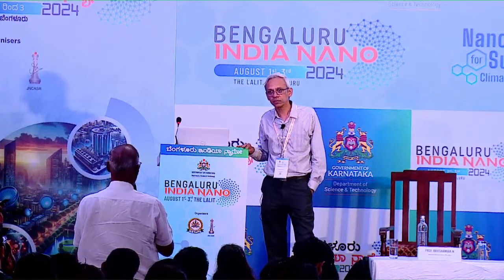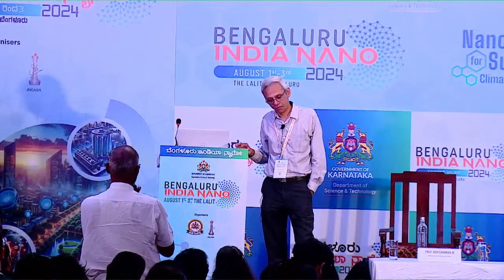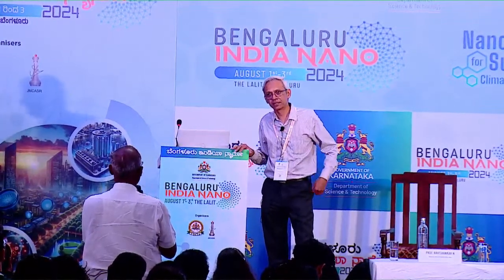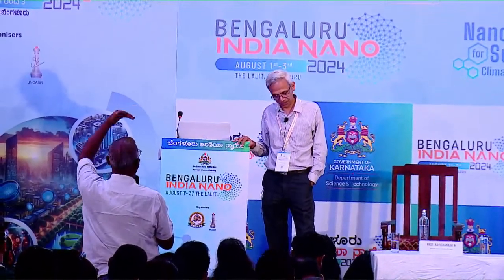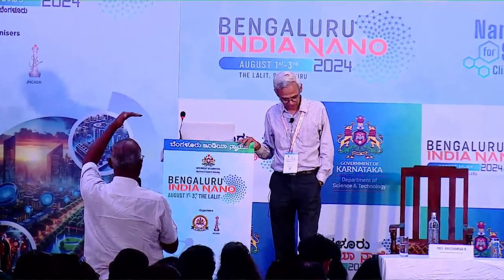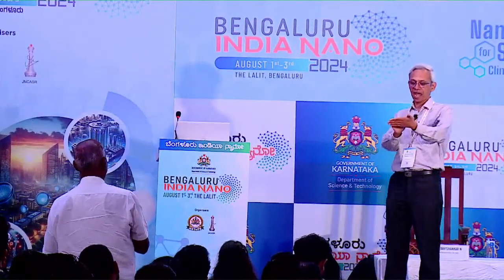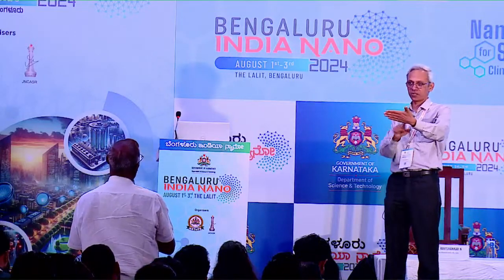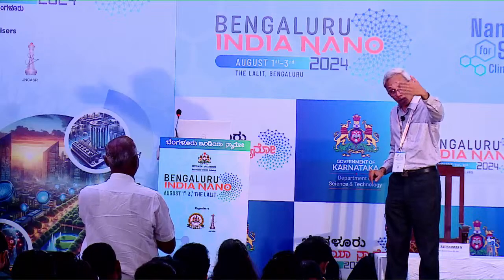In another one, resolution is identifying two separate objects, two different objects. Yes, but at what distance? Supposing we are not able to see the top of the Himalayas, why are we not able to see the top of Mount Everest? Very good point. If I have two dots here, I may be able to see them, but if they are very far away, I cannot see them. That is why we talk about resolution.